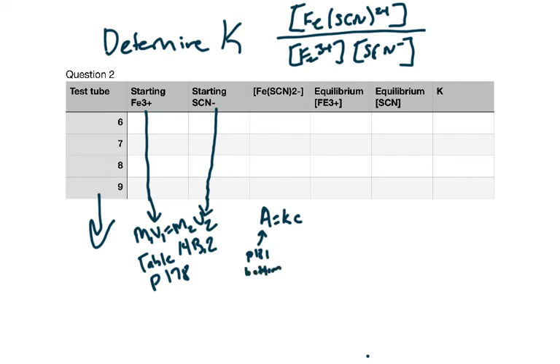So you made all of these test tubes, put them in the spectrophotometer, and found the absorbance. Then there's the K value you just calculated in the first part, from the graph that I just went through on the previous page. C is what you're looking for. So you can take your absorbance value, divide it by your K, and that will equal your C, which is your iron thiocyanate.